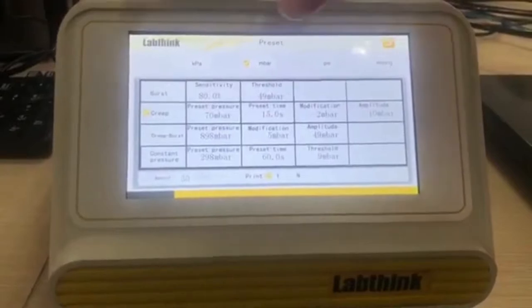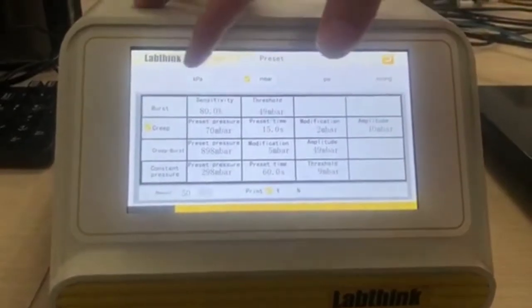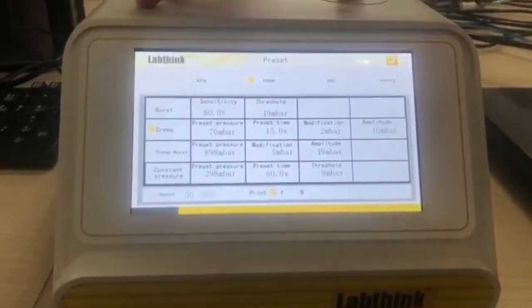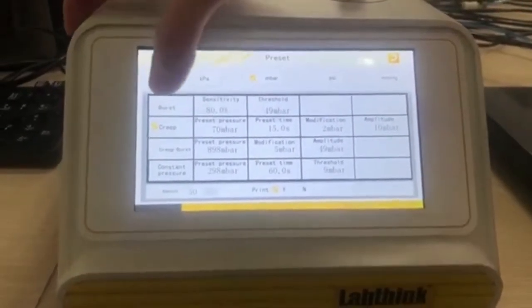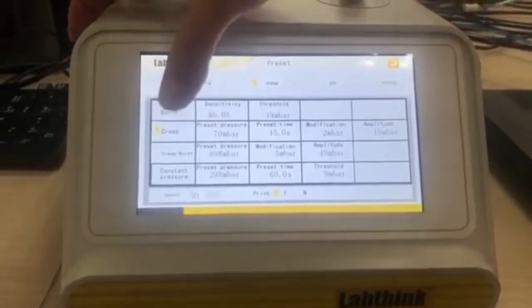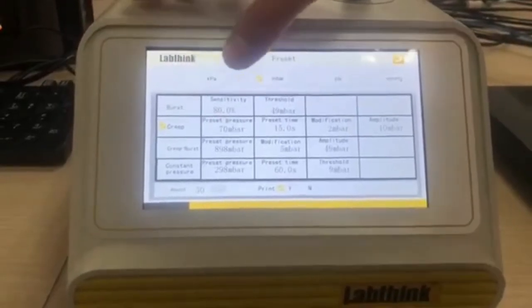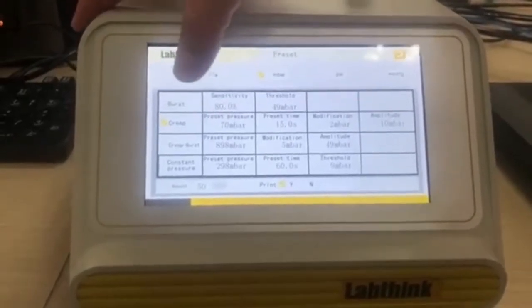You can see there are four test programs. The second one is the creep test. It is also called the pressure decay.